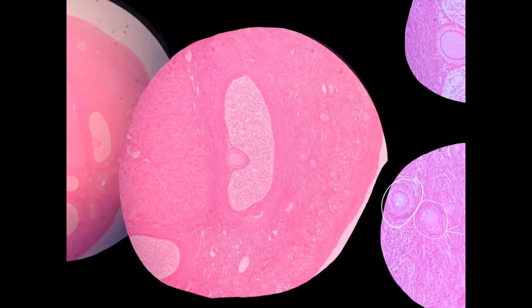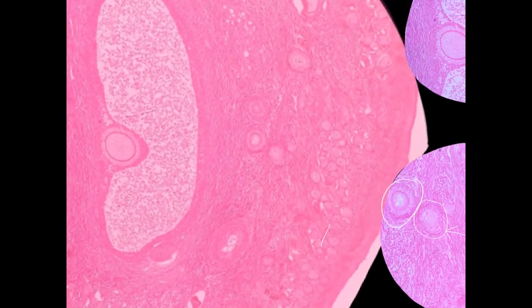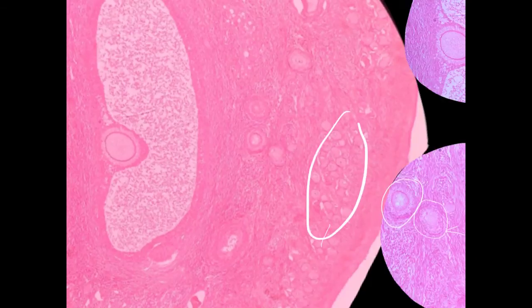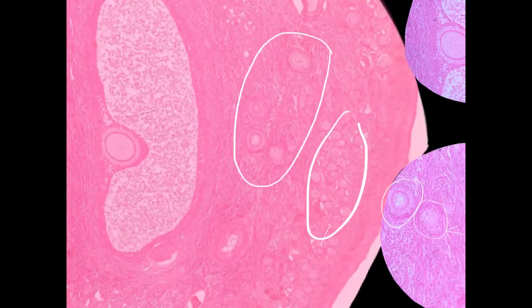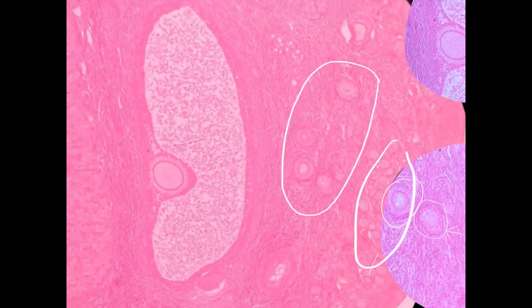If we get this out of the way, we can see the primordials over here and some intermediates, probably small secondaries in this slide. Remember, we're making a slide, freezing time. Sometimes you'll catch small Graafian and large secondaries, sometimes vice versa. That's what we see here. We don't see great examples of secondaries, but we see a really nice example of the Graafian follicle.